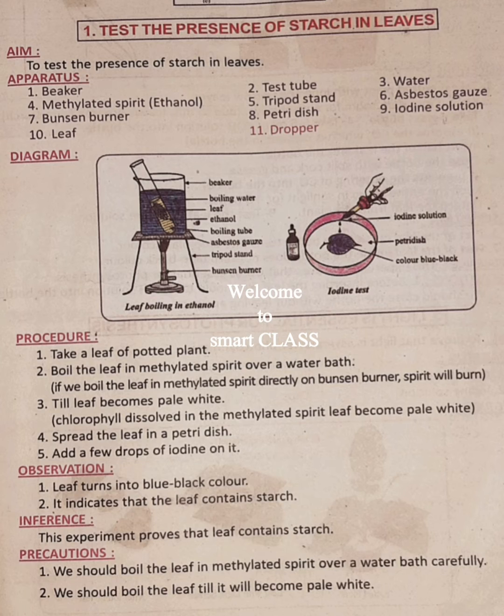Step 4: Spread the leaf in a petri dish. Step 5: Add a few drops of iodine solution on it.